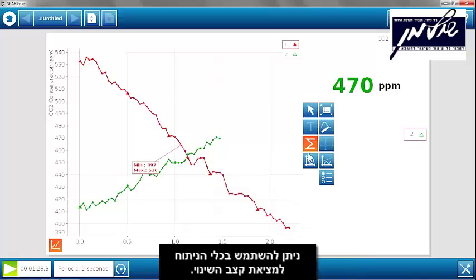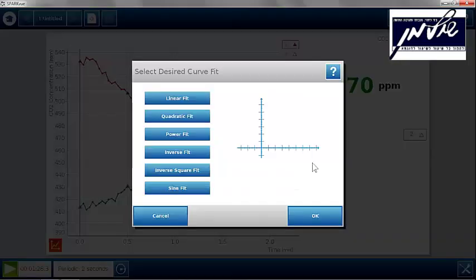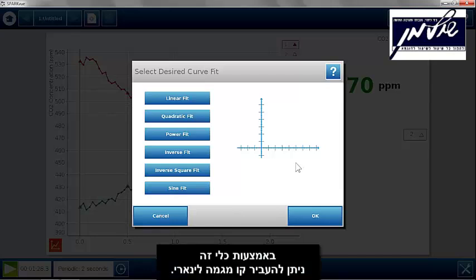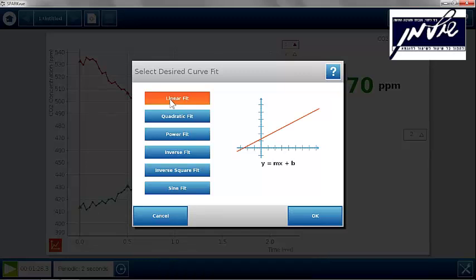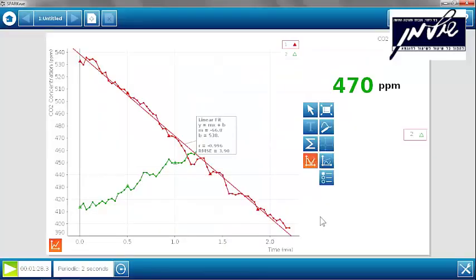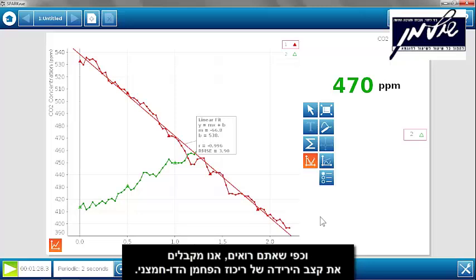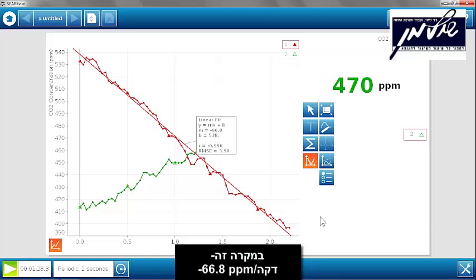You can also use the graph tools to find the rate of change. Using this tool, we can do a linear fit. The linear fit gives us the rate of carbon dioxide decrease — in this case, negative 66.8 parts per million per minute.